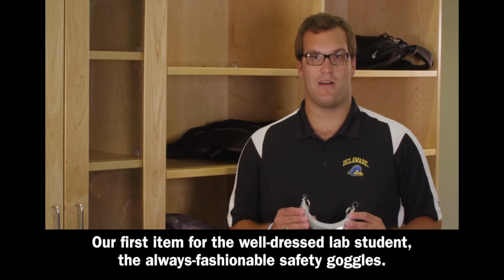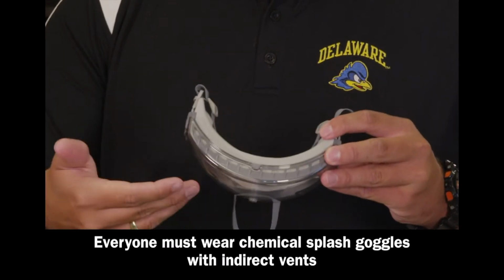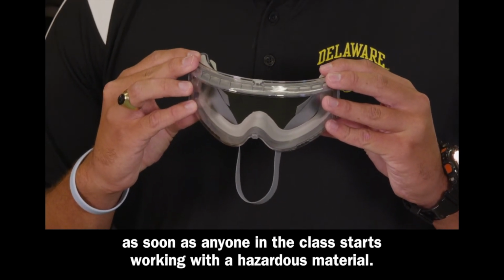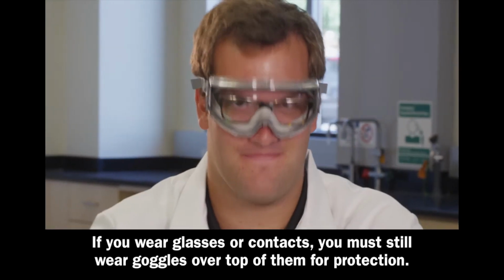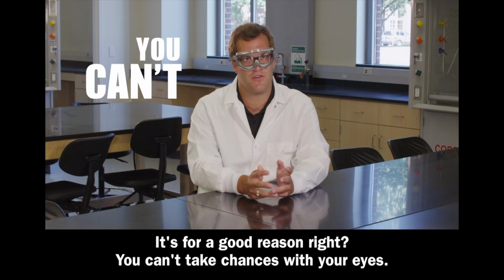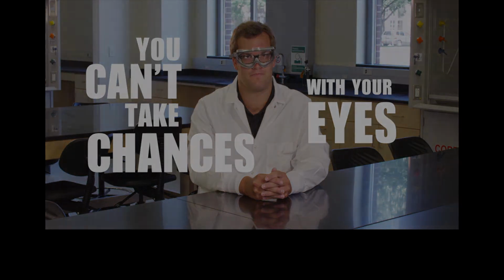Our first item for the well-dressed lab student, the always fashionable safety goggles. Everyone must wear chemical splash goggles with indirect vents as soon as anyone in the class starts working with a hazardous material. If you wear glasses or contacts, you must still wear goggles over top of them for protection. If you arrive at lab without your goggles, you'll be asked to leave the lab once the experiment starts. It's for a good reason, right? You can't take chances with your eyes. By the way, goggles can be purchased at the school bookstore.